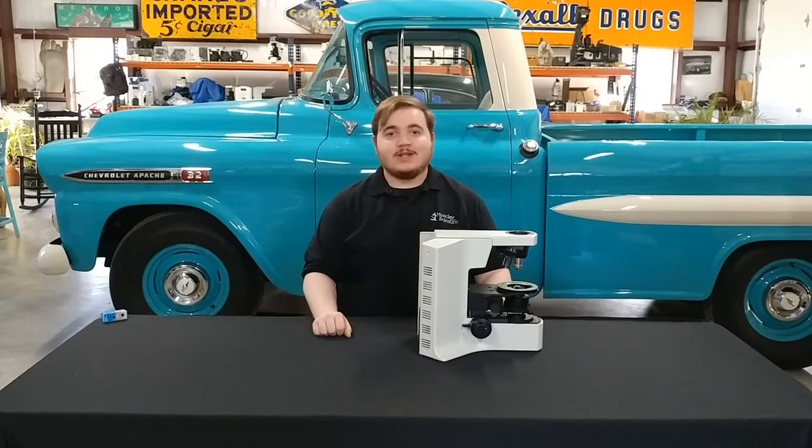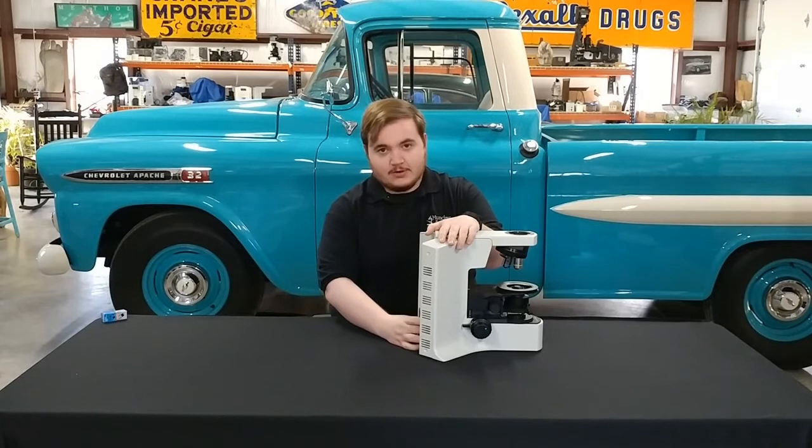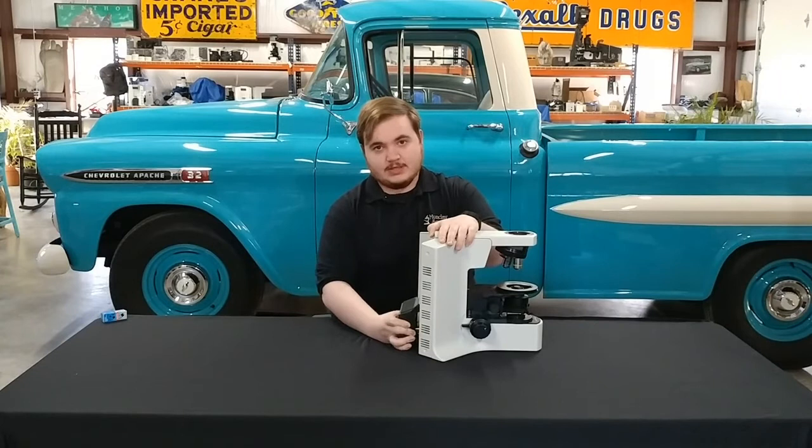We're going to start off today by removing the lamp house. Place it on top of the microscope and grip both sides of the lamp house. Squeeze gently and pull straight out. It's going to offer a little resistance, so wiggle if you have to.